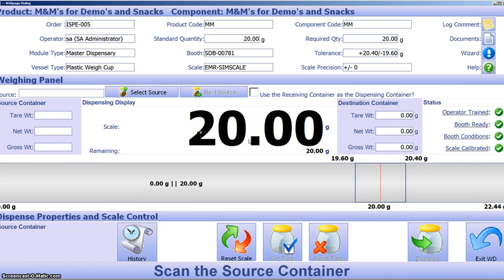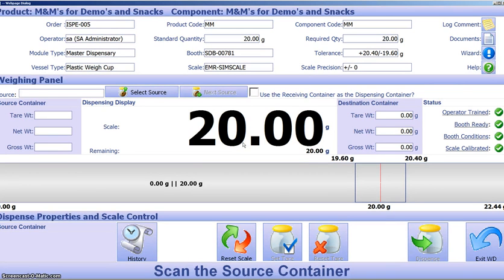We notice into the material side, we have the ability to select a source. And the quickest way to do something like that is with a barcode. So we're going to take our source container and scan that, just like it says down in the instructions.